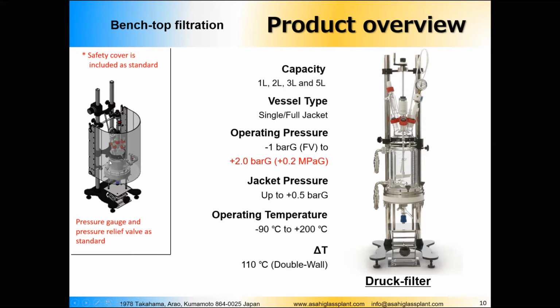That is very important. And I think maybe that's the point that I should have started with. The equipment has the pressure gauge and the pressure relief valve as standard, and those are the accessories that are a must for this kind of glass equipment. So the pressure gauge is something that you need to measure the pressure, that's pretty obvious. And the pressure relief valve, you can see it here.